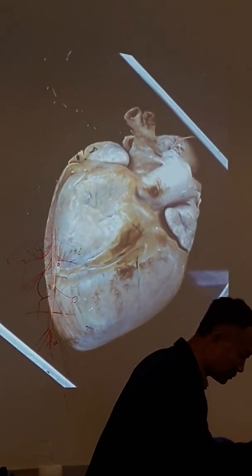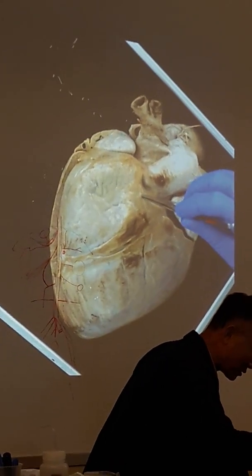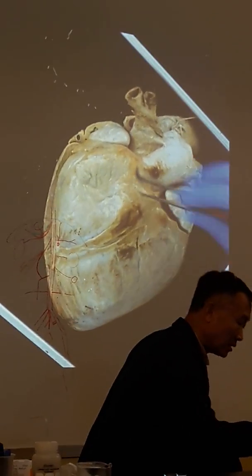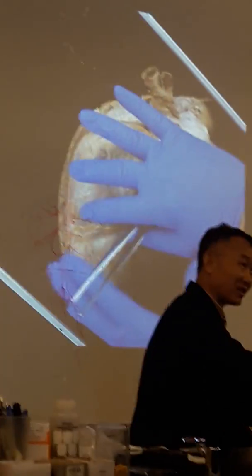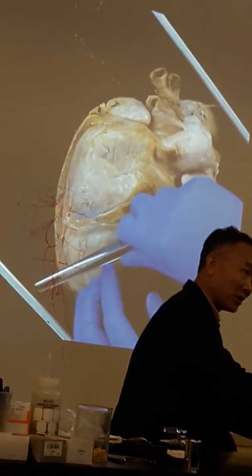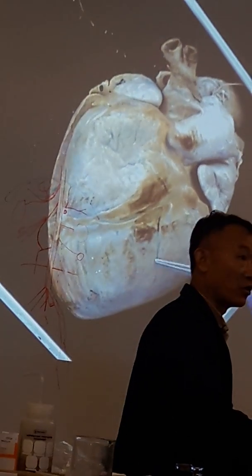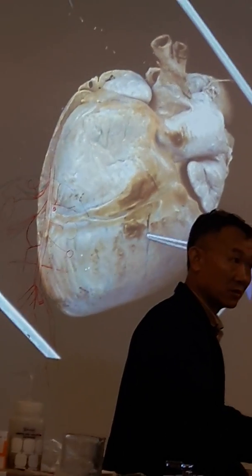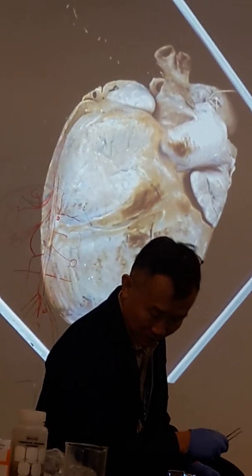Okay. Epicardium. See, very thin membrane covers. That's epicardium. Visceral epicardium. Okay. The parietal pericardium, when you dissect the cats, right? There is a plastic bag like thing outside. You have to get rid of this plastic thing. That's the parietal pericardium. The one attached to the heart, almost inseparable. Okay, visceral pericardium. Oh, visceral epicardium.